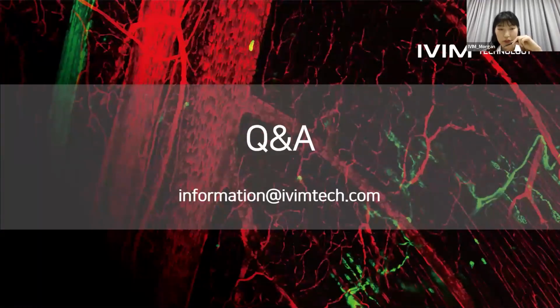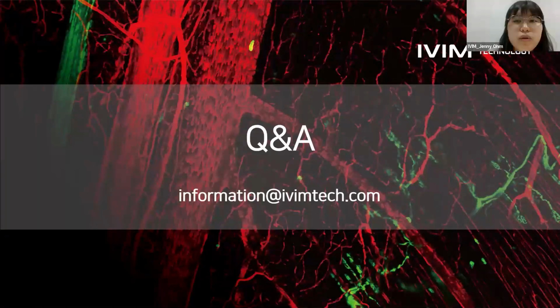So our first question is, how long does the mouse survive with the chamber? It very much depends on what kind of organ you have implanted the imaging chamber with. For example, with the brain or the cranial imaging window chamber that I showed you today in my presentation, the mouse can survive up to about a year if inflammation is taken very good care of.